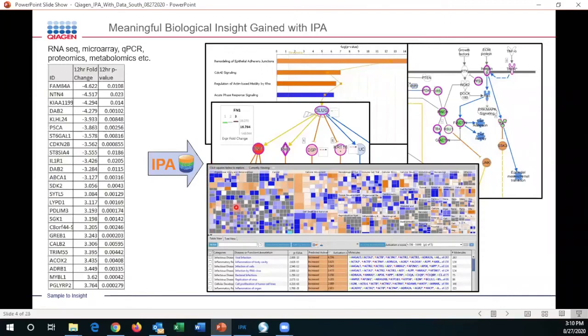It could be a function like apoptosis or necrosis, or it could be an indication like glioblastoma, things that we looked at earlier. The size of the box represents the significance of enrichment of data set molecules. The coloring, again, is that follow-up question. When we identify what could be the consequences, how are the consequences manifesting? Are they manifesting as an increase or a decrease? Again, this is driven by the observed pattern of expression in our data set.